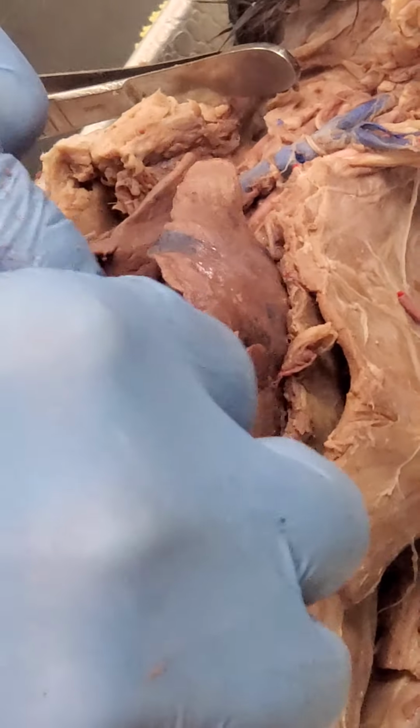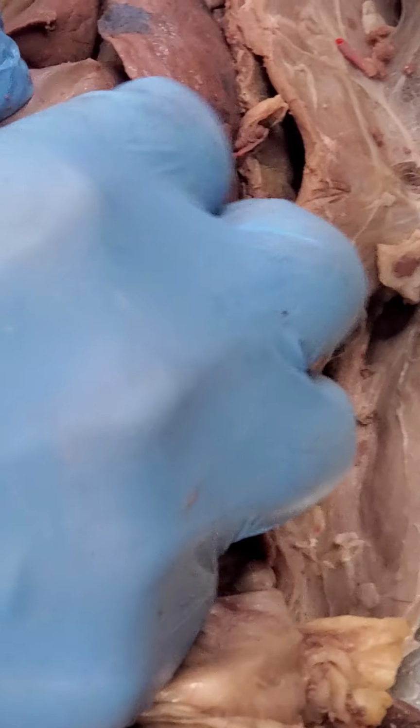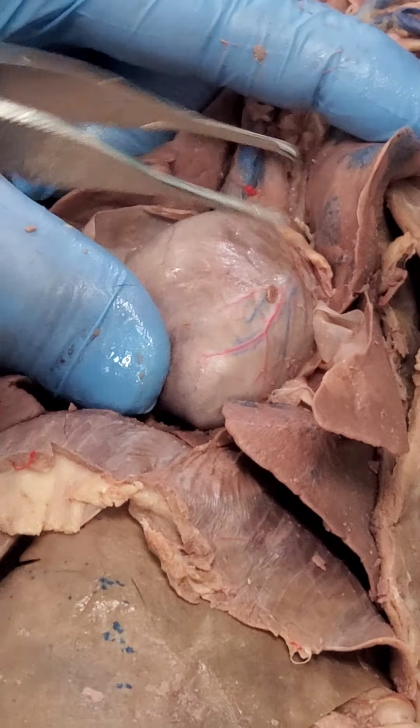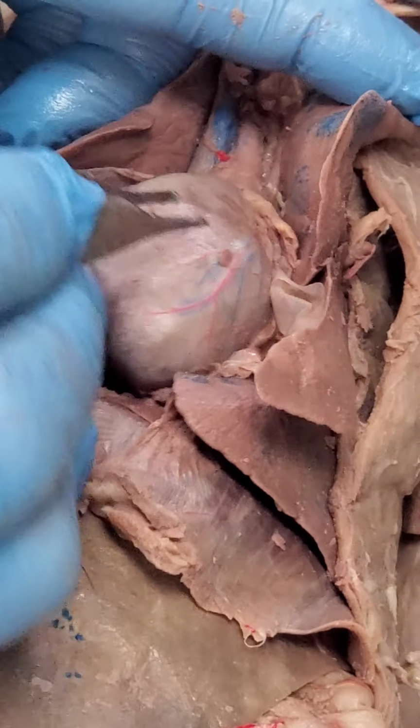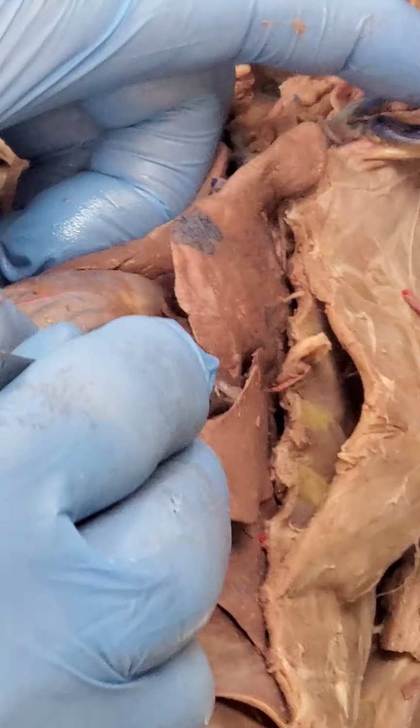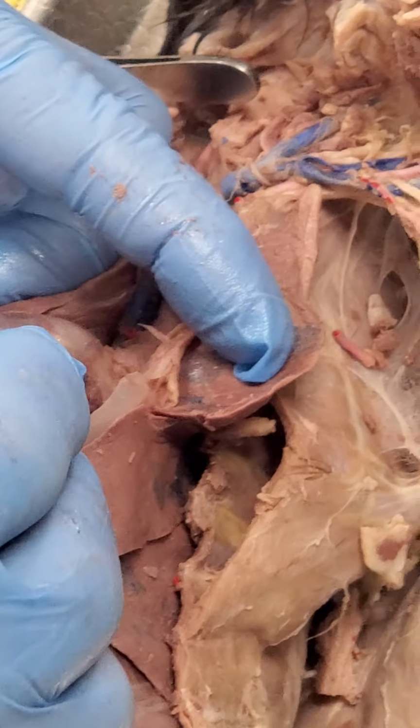You'll say, what is that stupid membrane? Oh, parietal pericardium. Visceral pericardium is right there. See, that's what the cow hearts were. Once you peel this away, that's all visceral pericardium now. Then you can see the little right atria. See the darker brown bit there? That's the interventricular sulcus, left and right ventricle there. Here's the left atria, kind of tucked around the back here.